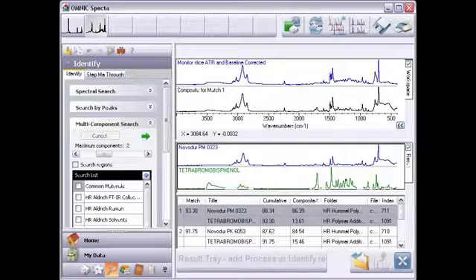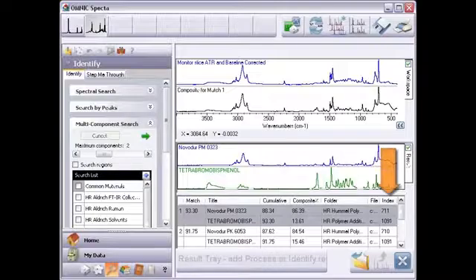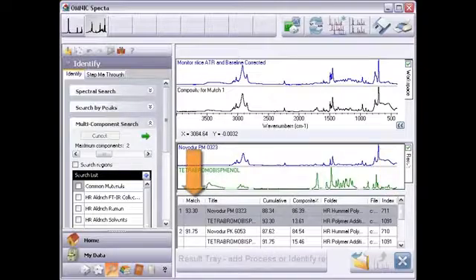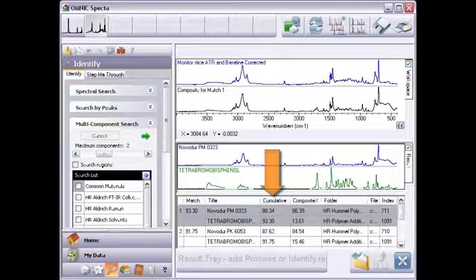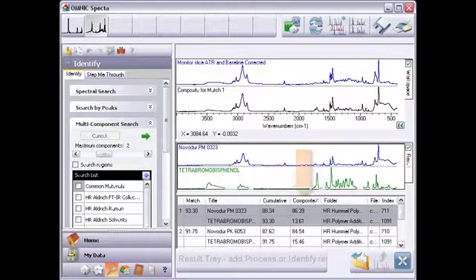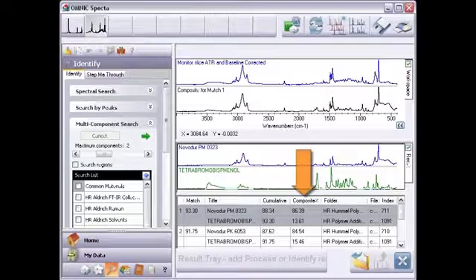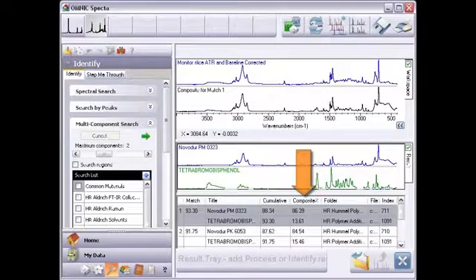If the match is from a spectral library, this column shows the library name, and this one gives the index number of the library spectrum. The match number indicates how well the composite spectrum matches the unknown. The cumulative value shows the contribution of each reference spectrum to the overall match. The composite percent is a scaling factor indicating the amount of each found reference represented in the composite spectrum.